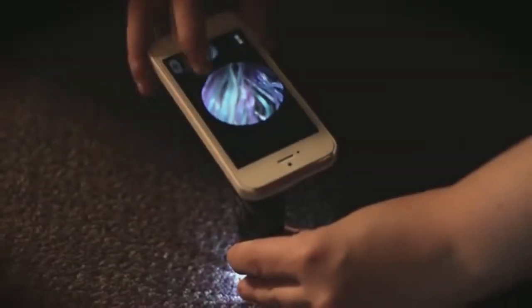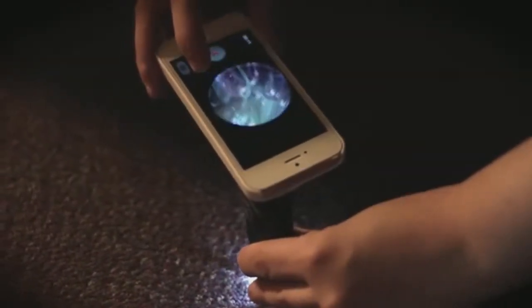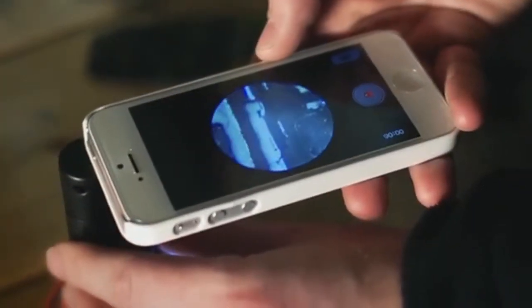What I personally love about the Micromax Plus is you don't have to compensate for any bad lighting. It has a built-in LED light that completely illuminates your surface area and makes for crisp, bright images.